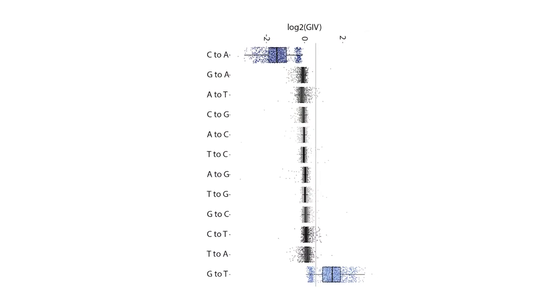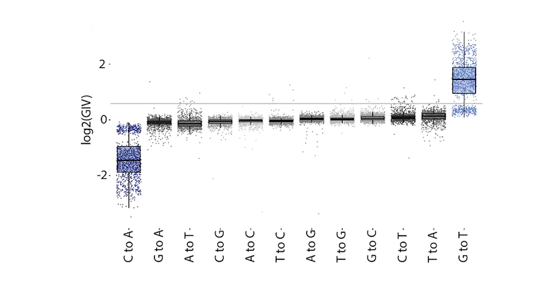The next question that we wanted to address is how prevalent this damage is in sequencing facilities that handle real cancer samples. We therefore requested access to The Cancer Genome Atlas data and found that more than 80% of the datasets have a significant imbalance of G to T, indicative of damage. It is likely that the majority of sequencing currently done has a large degree of undetected damage. Consequently, the rare and possibly interesting variants are confounded by incorrect data derived from this damage.